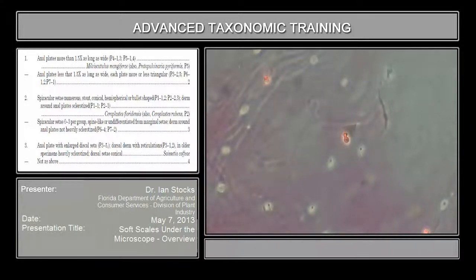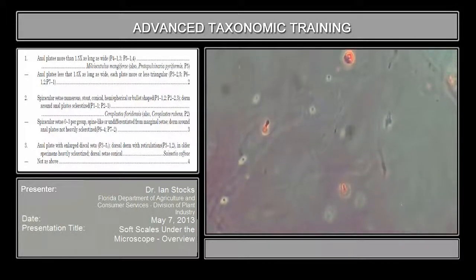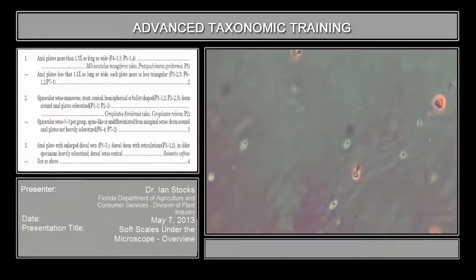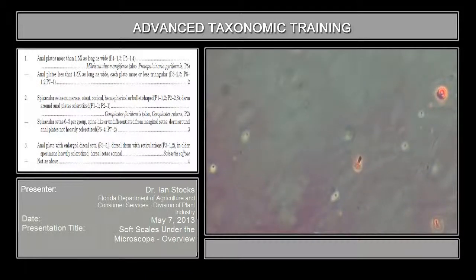Now, if you do move more into the center, pick out, if you can, some of the dorsal setae. In this specimen, there'll be a prominent socket and a fairly short, stout setal structure that's a little bit clubbed. It gets expanded towards the tip a little bit. Can you see that in this one right here?